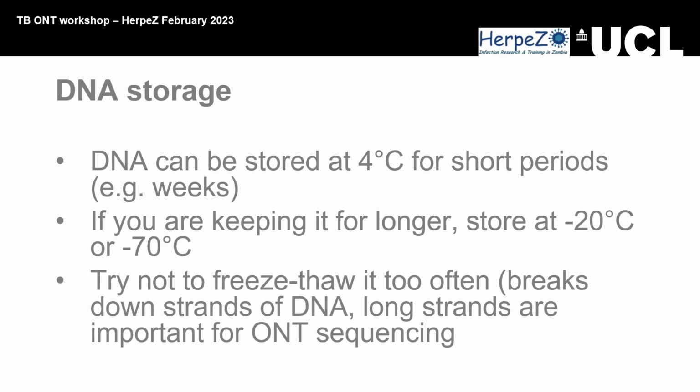So either you can leave it at 65 degrees for an hour, for instance, or you can leave it overnight in the fridge, and it will be slower to go back into the water. If you, for instance, Qubit it immediately, you would probably find that you'd get a lower reading than if you left it for 24 hours, because your DNA is still probably stuck on the bottom. That pellet, remember, you dried to a crisp, and also it's been centrifuged, so it's going to take quite a lot of effort to reconstitute that pellet.